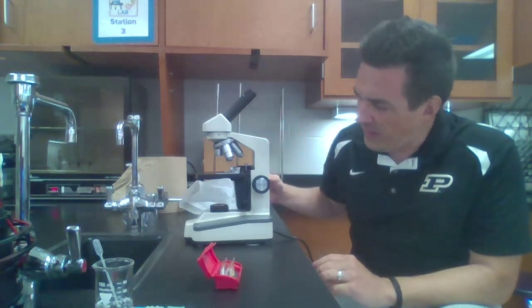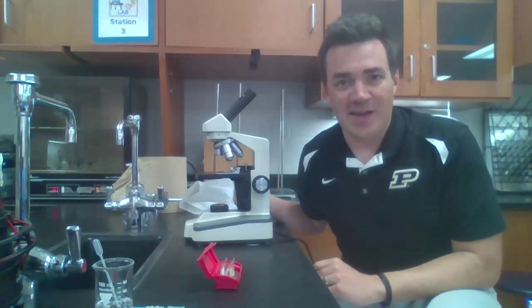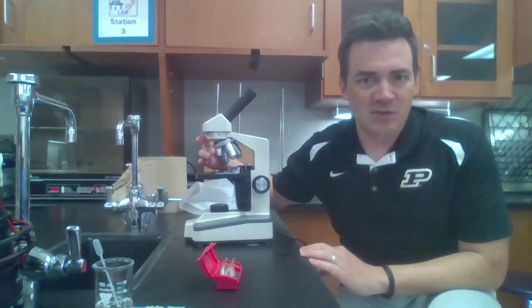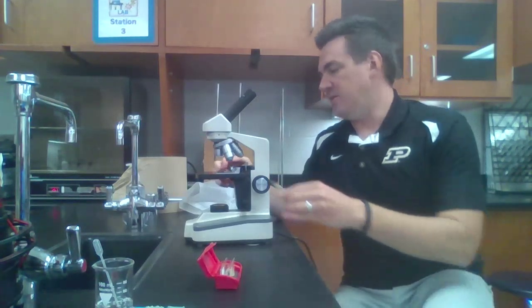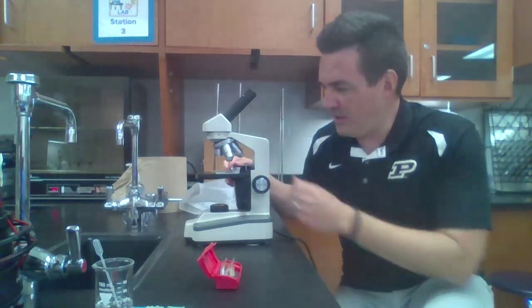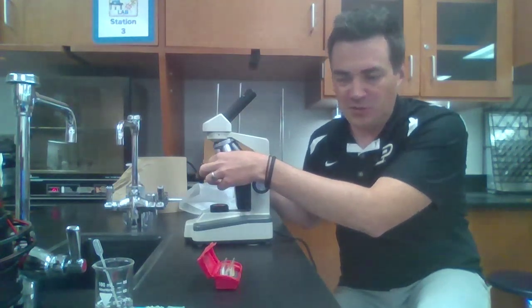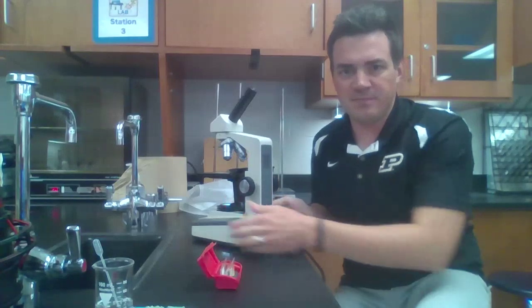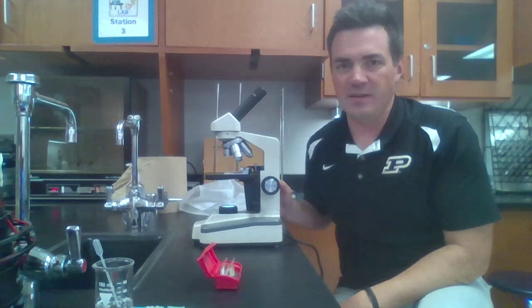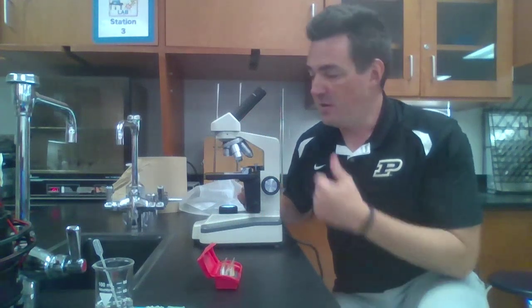Now, if the person who was using the microscope the last time did it properly, they should have lowered the stage all the way and turned it back to low power, which is the red lens here. We're going to put the slide right in here on the stage using the little clamp thing here. All right, once you're ready, you can turn on the power. The power switch is right here in the back. And you're ready to go looking at the hair under the microscope on low power, the red objective lens.